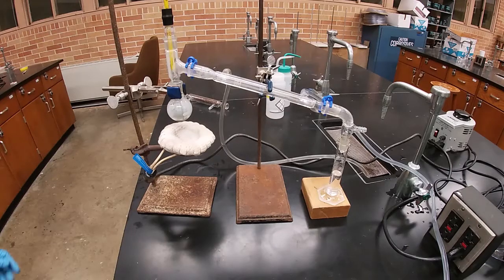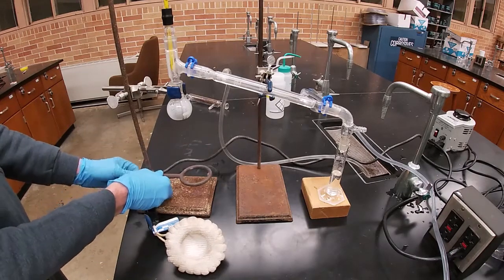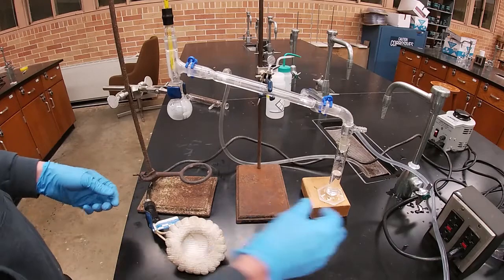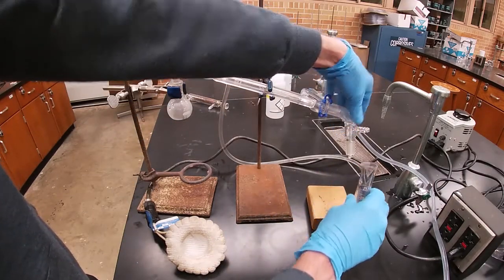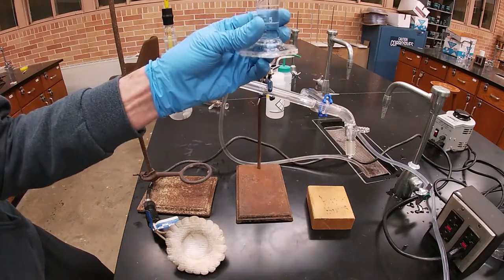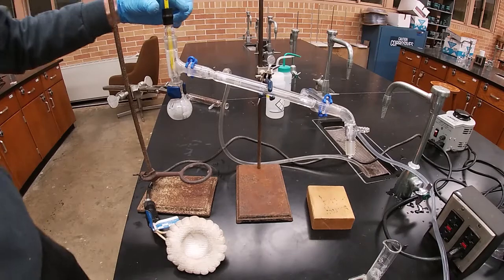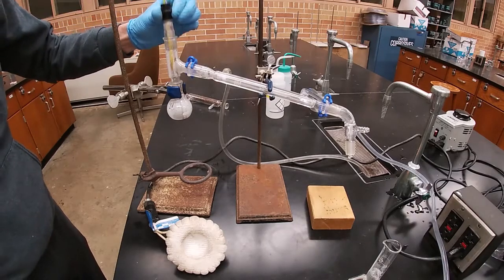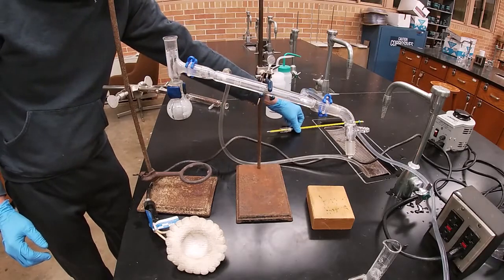Fractional distillation setup. This has cooled down a little bit. I can lower this. Okay, I'm going to reuse my methanol water that I have over here that I collected. So we got almost 15 mils. Okay, and I'm going to remove my thermometer and thermometer adapter because they're very fragile. I just want to be careful with it.